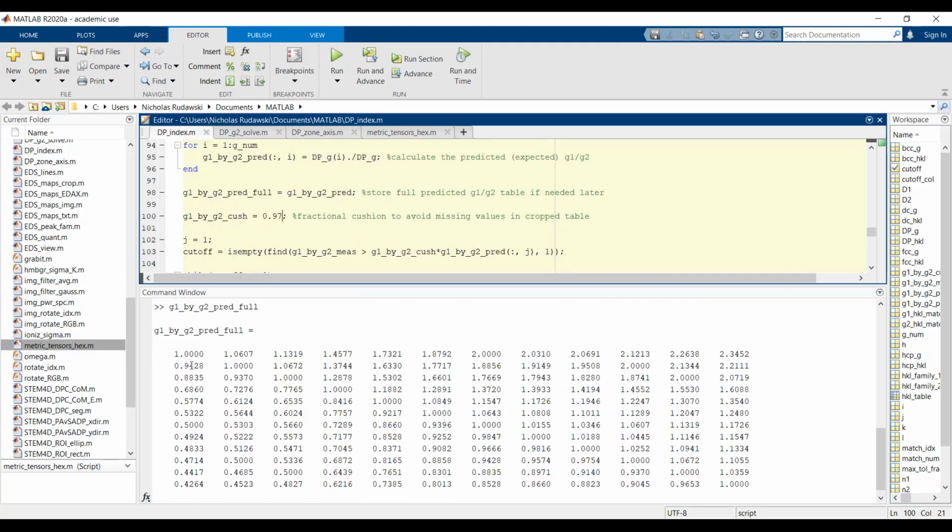So why is it not doing that? I'm curious as to why. Of course, really it shouldn't be going past these first two, right? This is really only where it should be going. Well, no, it's not technically true. It could be okay. So we have these other ones here. So this one we're going to have to put our thinking caps on a little bit more.